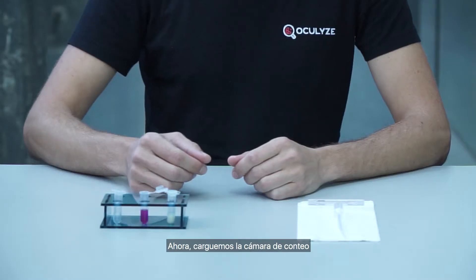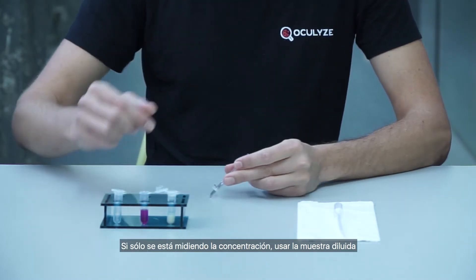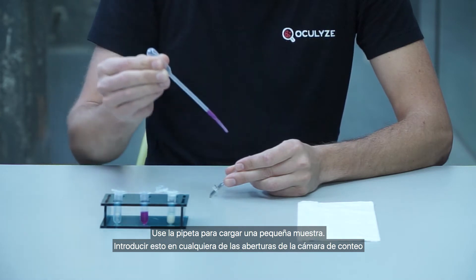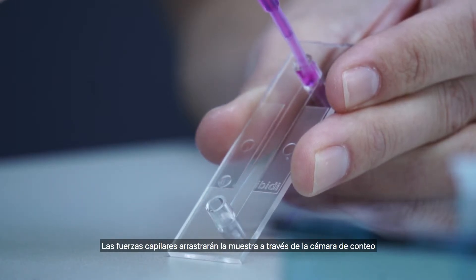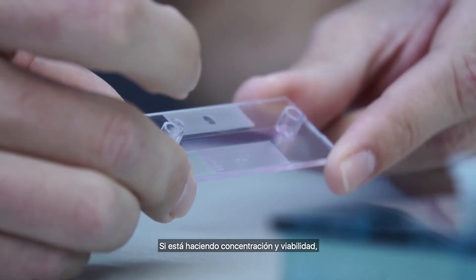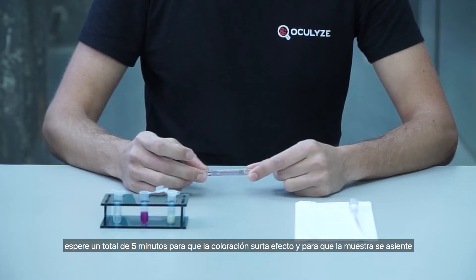Now let's load the chamber. If you're only measuring concentration, use the diluted sample. If you're measuring concentration and viability, use the stained sample. Use the Pasteur pipette to load a small sample and pipette this into either one of the chamber openings. Capillary forces will pull the sample through the chamber. If you're doing concentration, allow one minute for the sample to settle. If you're doing concentration and viability, allow a total of five minutes for the stain to take effect and the sample to settle.